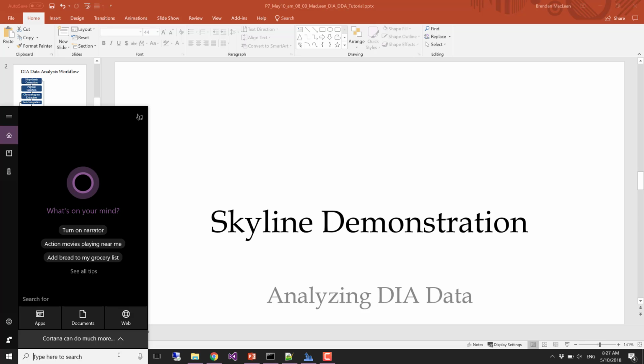We had a guy in our lab looking at transcription factors, and he could look at a peak and go, well, that's not the right peak. So you have to switch to more of an SRM mode, where you're getting used to looking at the elution profile of a peak, how the fragment ions are co-eluting, and what the retention time is.